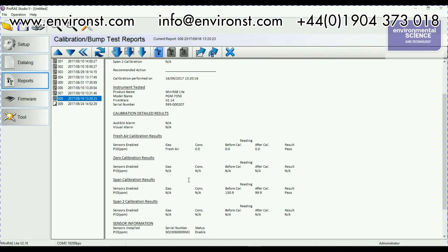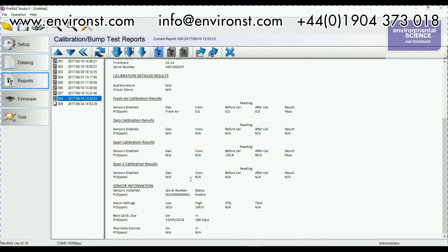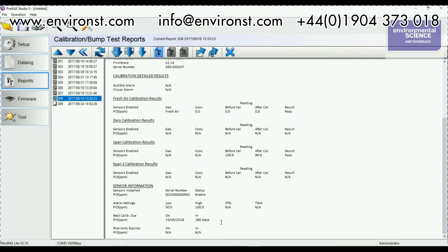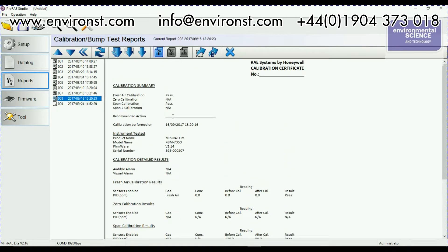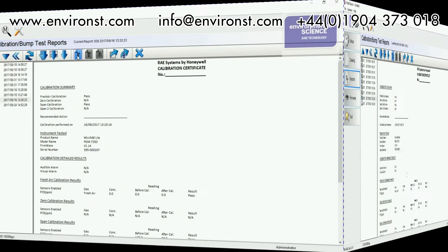Here you've got your zero results, your span results. It gives you a bit of sensor information here about what sensors installed and gives you a summary of your alarm settings. So that's very good for generating your own calibration reports.